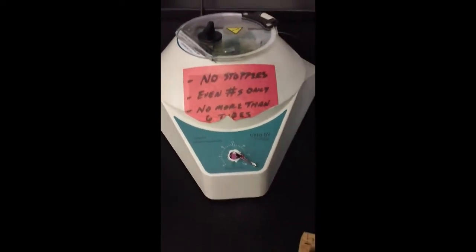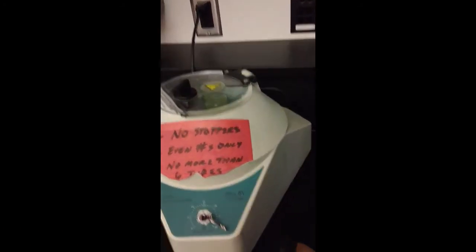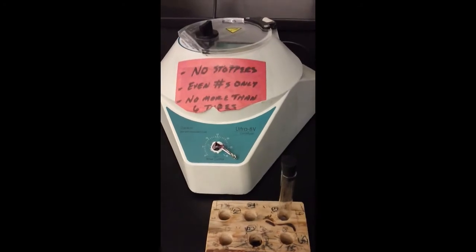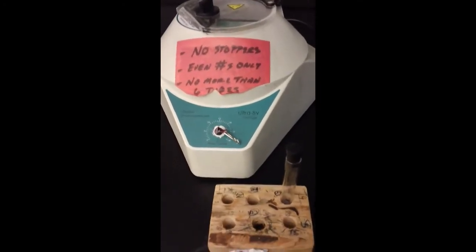So while it's centrifuging, the last one here, again, is chromium nitrate. After we get done, we're checking to see if we have solids. And I'm going to pick up this video right after we get done centrifuging it all, and then I'll show you what we get.